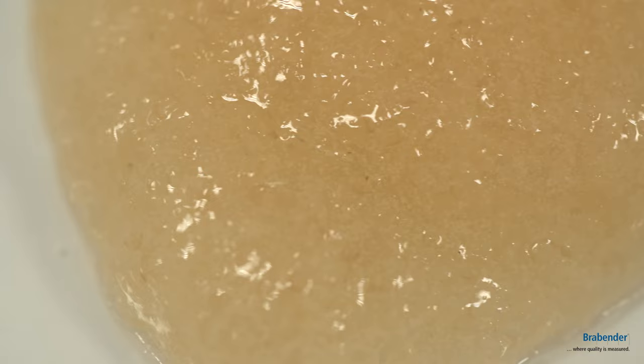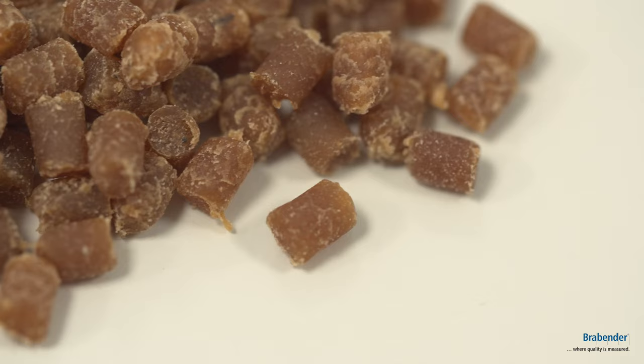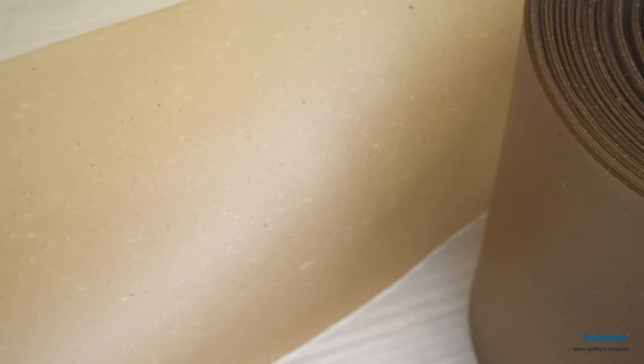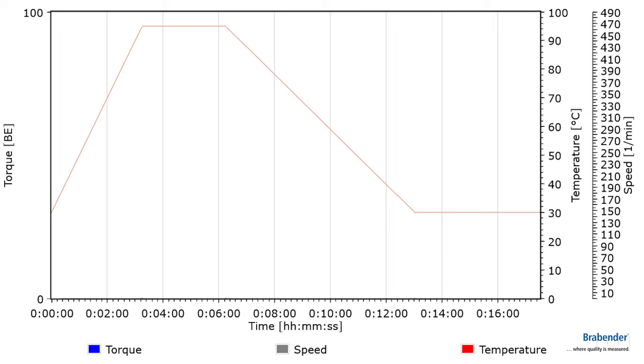Based on the analysis from the ViscoQIC, you can either create a blend of your raw material prior to processing, or you can determine the quality and adapt your process according to your raw material quality.